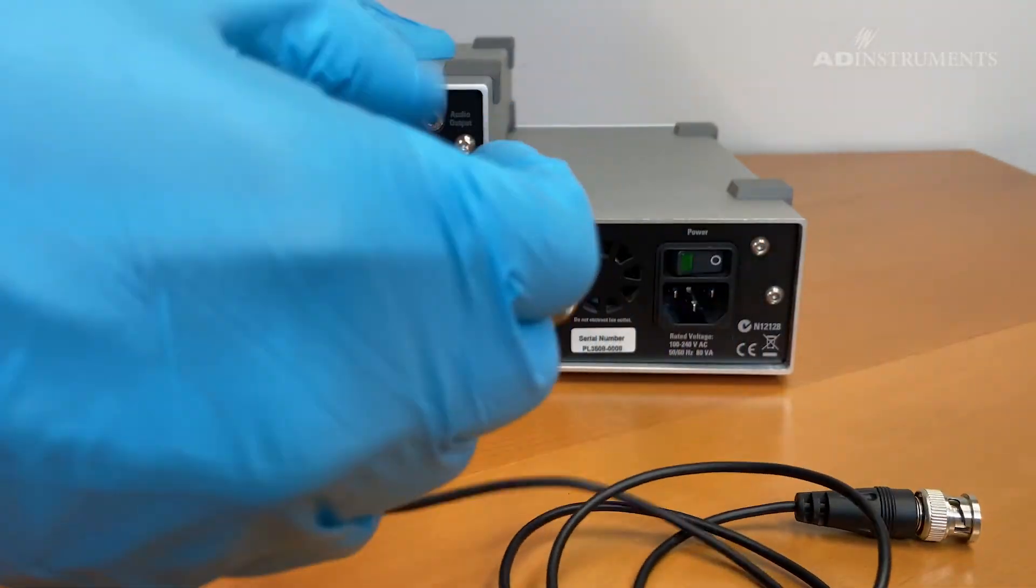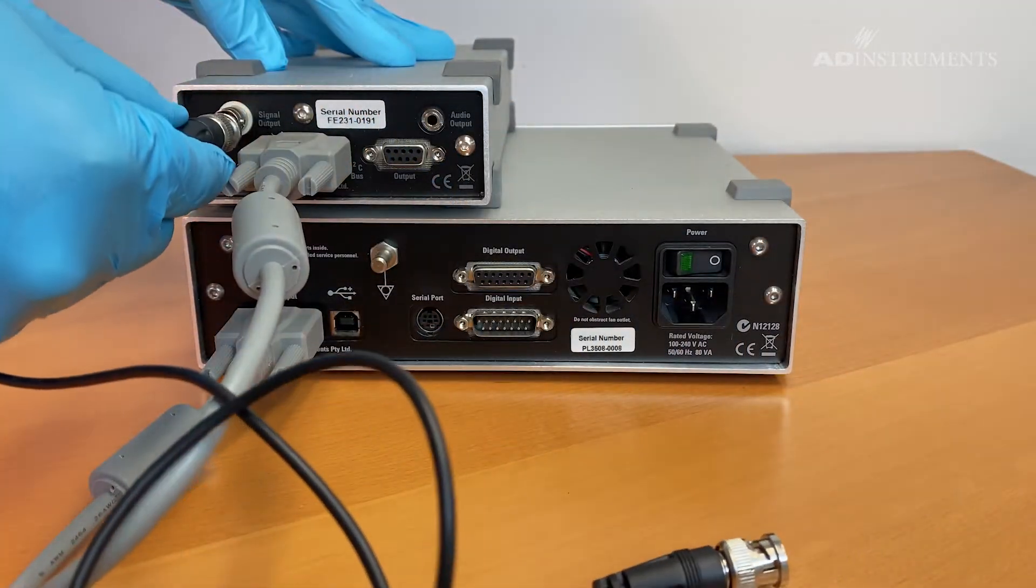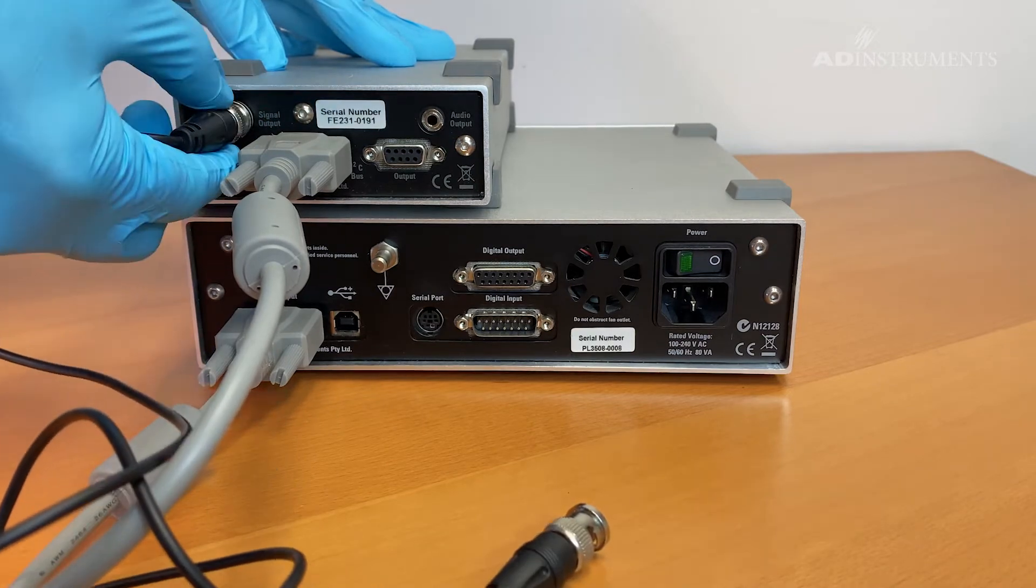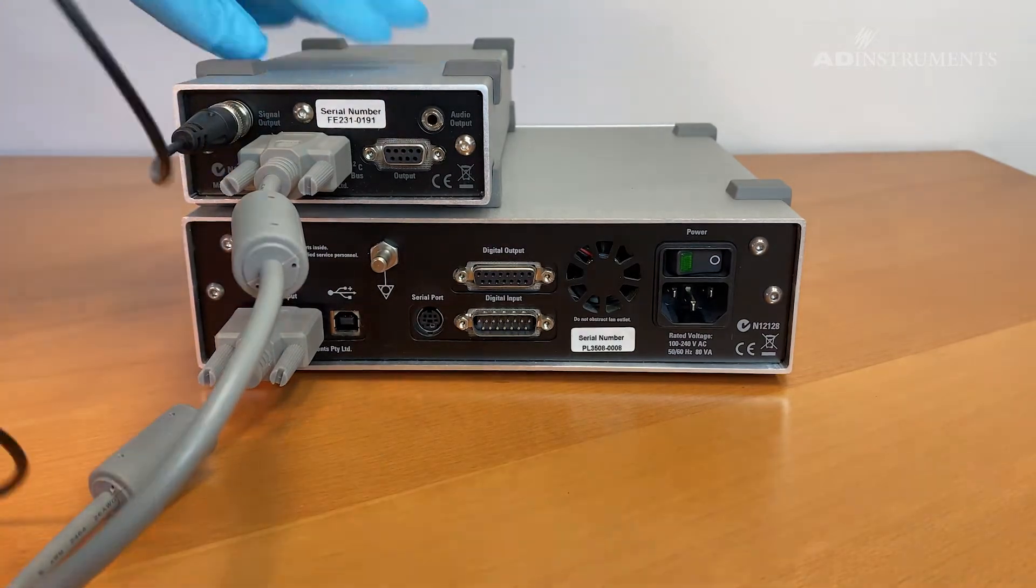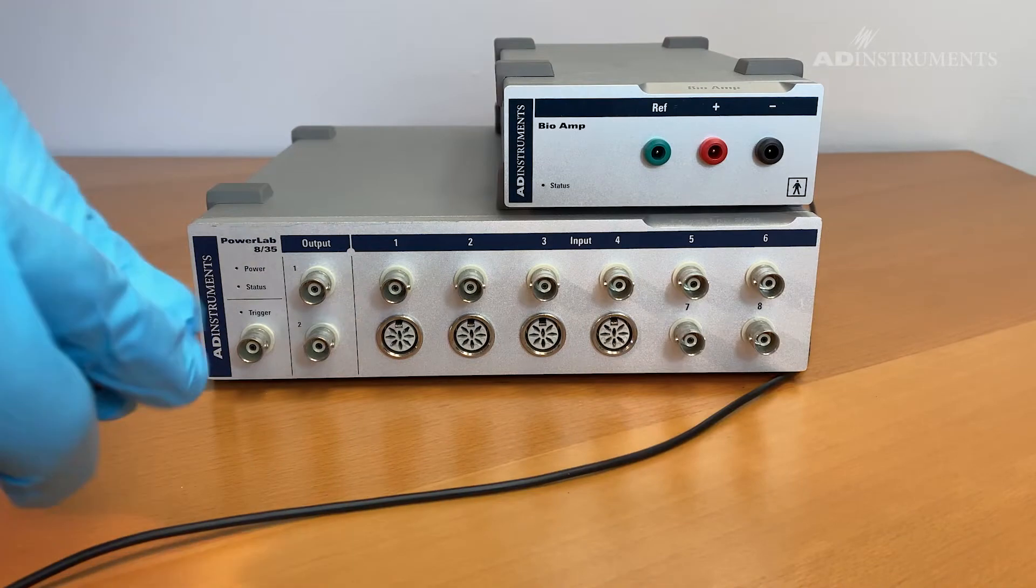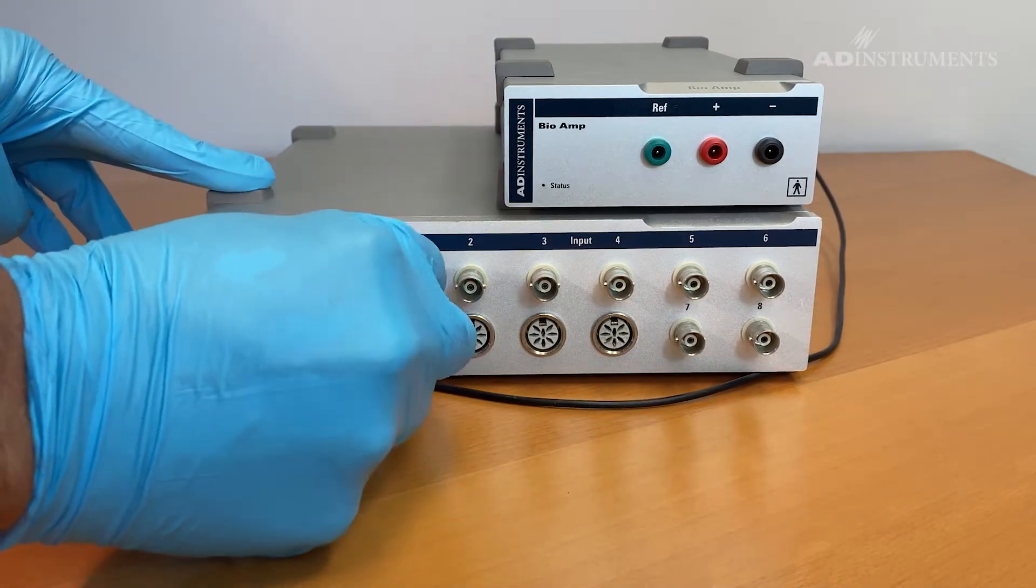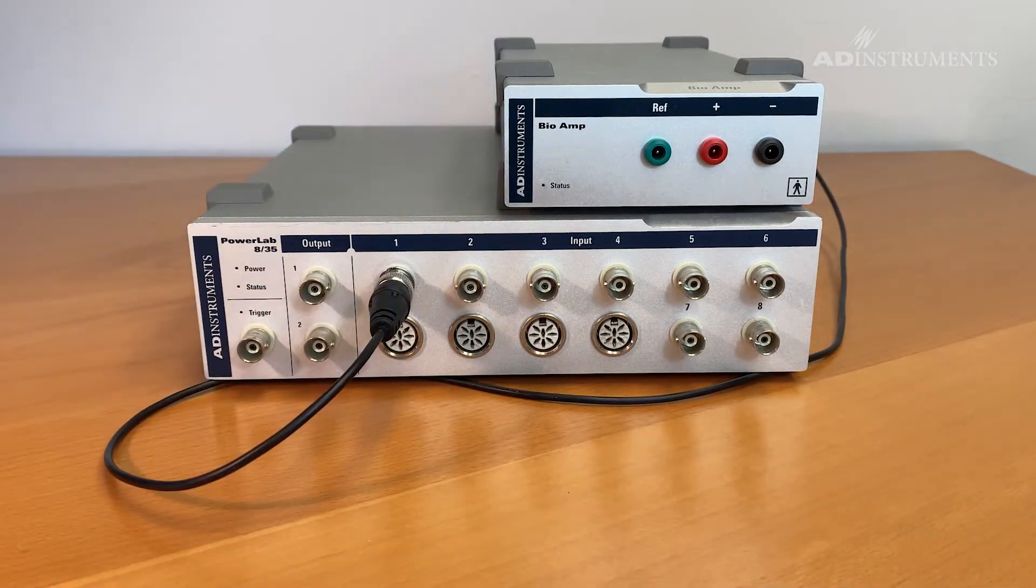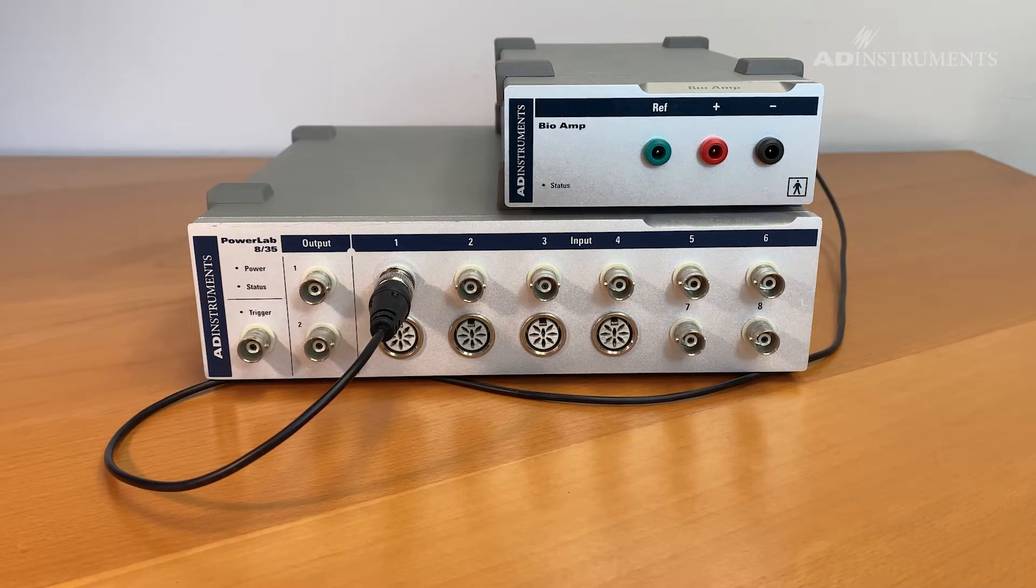Also connect the BNC cable to the signal output on the back of the bioamp. Connect the other end of the BNC cable to one of the channels of the power lab, keeping in mind that lab chart will recognize the bioamp on the channel that the BNC cable is connected to.